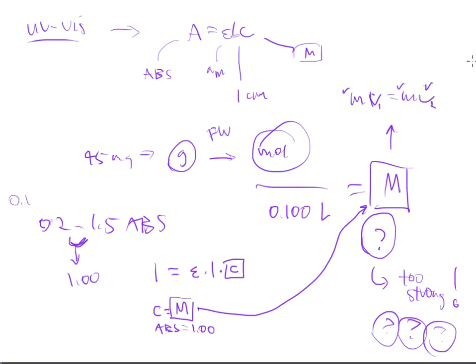How much do you want to make, right? Our cuvettes hold just a handful of milliliters at a time, not very many at all. So, do you want to make 10 milliliters of the diluted sample? That's great. Do it. If you want to make 25, you want to make 50, that's up to you. Right? That's why this is worded the way that it is. We are letting you make that decision because you need to be comfortable making these decisions in order to prepare samples to run on instrumentation. Okay? So that's going to be the first objective here.